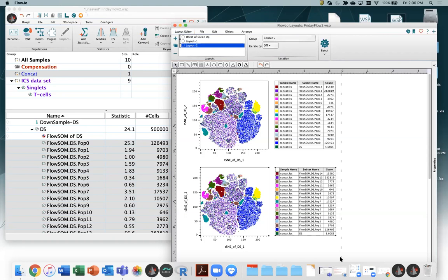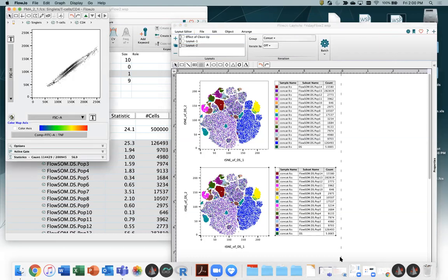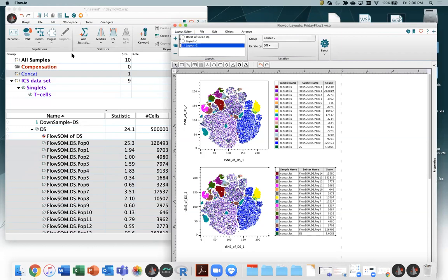And if you look at cluster 1 and cluster 2, and cluster 1 had a large number of events, and 2 had very, very few events, and you look at their profile across all the different parameters and they're extremely similar, you might think, well, it's enough to assume that that's part of that main larger population. If you see that there is a parameter that it's different on, then that's worth considering. All right, is this parameter something meaningful that me, as the expert on what this data is, that a difference in that measure says something to me, that this really could be a very different kind of cell?